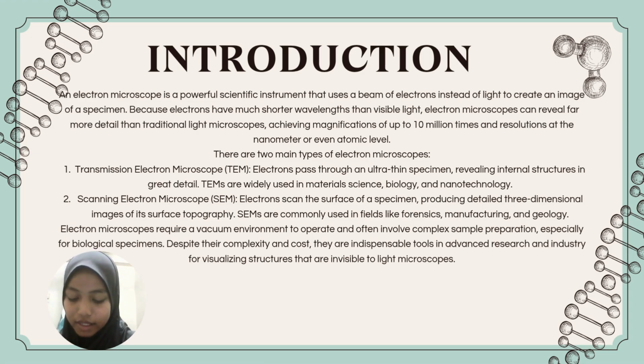The second one is the scanning electron microscope. A scanning electron microscope scans electrons across the surface of a specimen, producing a detailed three-dimensional image of its surface topography. Scanning electron microscopes are commonly used in fields like forensics, manufacturing, and geology.